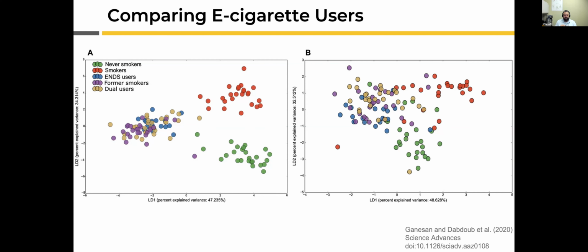So they are pictures, but they're not quantitative metrics. And so the biological reality is really best answered by the statistical methods that we're getting at, combined with utilizing measures of beta diversity that tell you something interesting about the community that you're looking at.